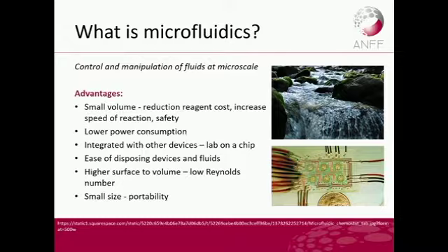So what is microfluidics? It's essentially the control and manipulation of fluids at a micron scale. You think about rivers, fluids flowing, and you bring that down into a microchannel, basically the size of your hair. Bringing a macro scale down to a micro scale, you will see different phenomena as opposed to when you're looking at fluidics at a macro scale.